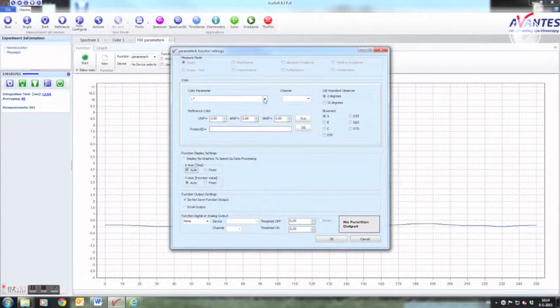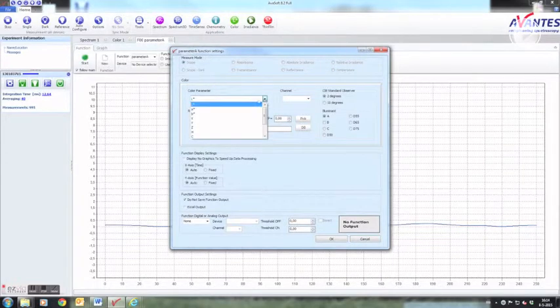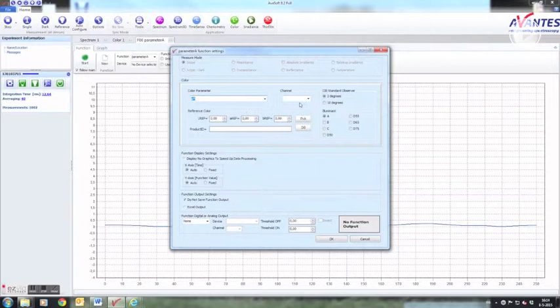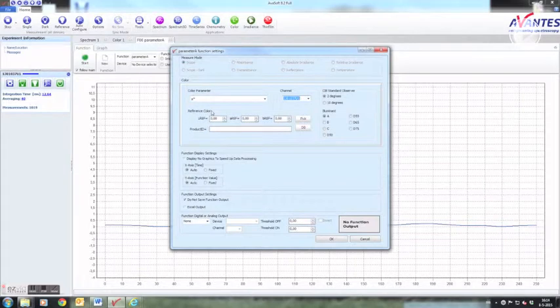Here you can select which parameter and from which spectrometer you want to measure. Reference color is not applicable in this case.